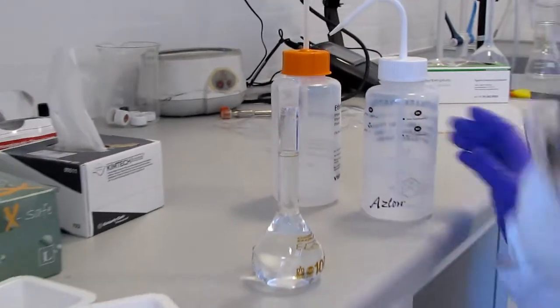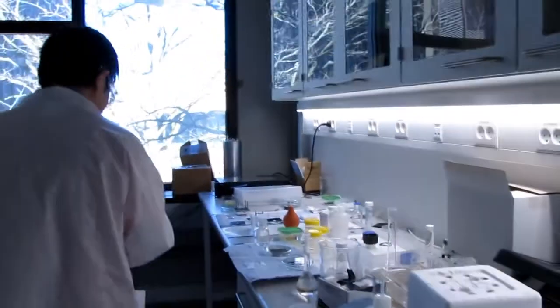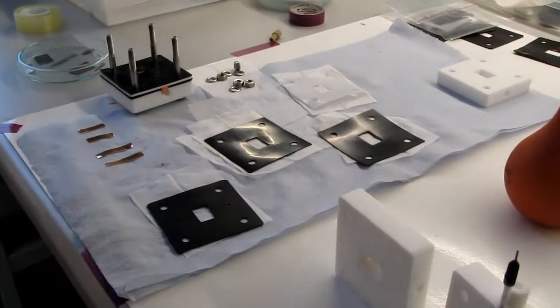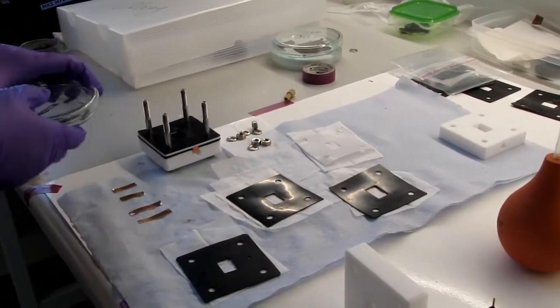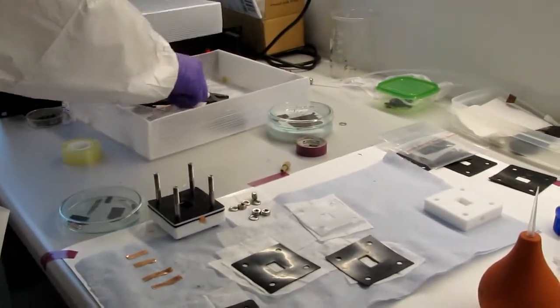Okay, it's done. Show the solvent. Now I'm going to assemble everything. Basically, this is the sample we're using. I have a tweezer, maybe it's easy to show.